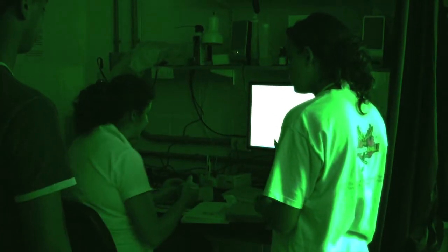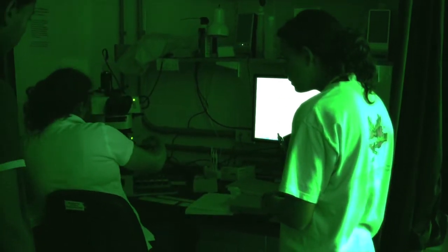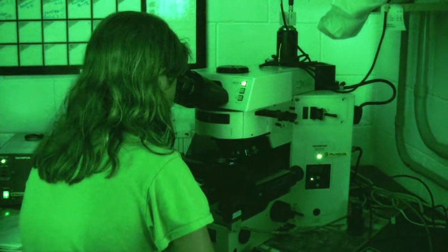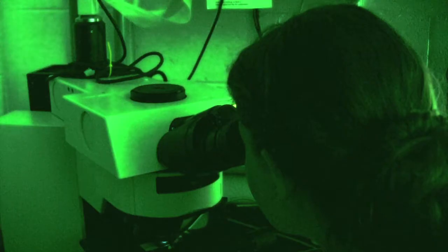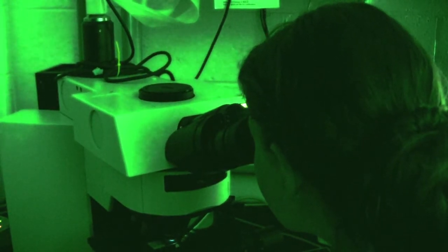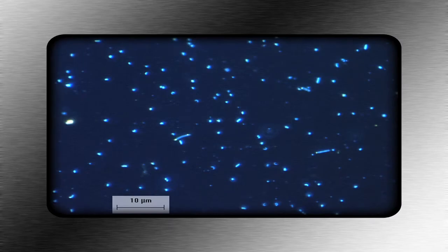We came into the dark room to use the epifluorescent microscope to count the bacteria we just stained. First, we get the same oil and put a drop on top of the cover slip, then set the slides into a groove on the microscope stage. Once we got to that point, we switched to the computer and moved the joystick to get different fields of view. We found 12 of those, focused on each one, took a picture, and saved it to a folder.